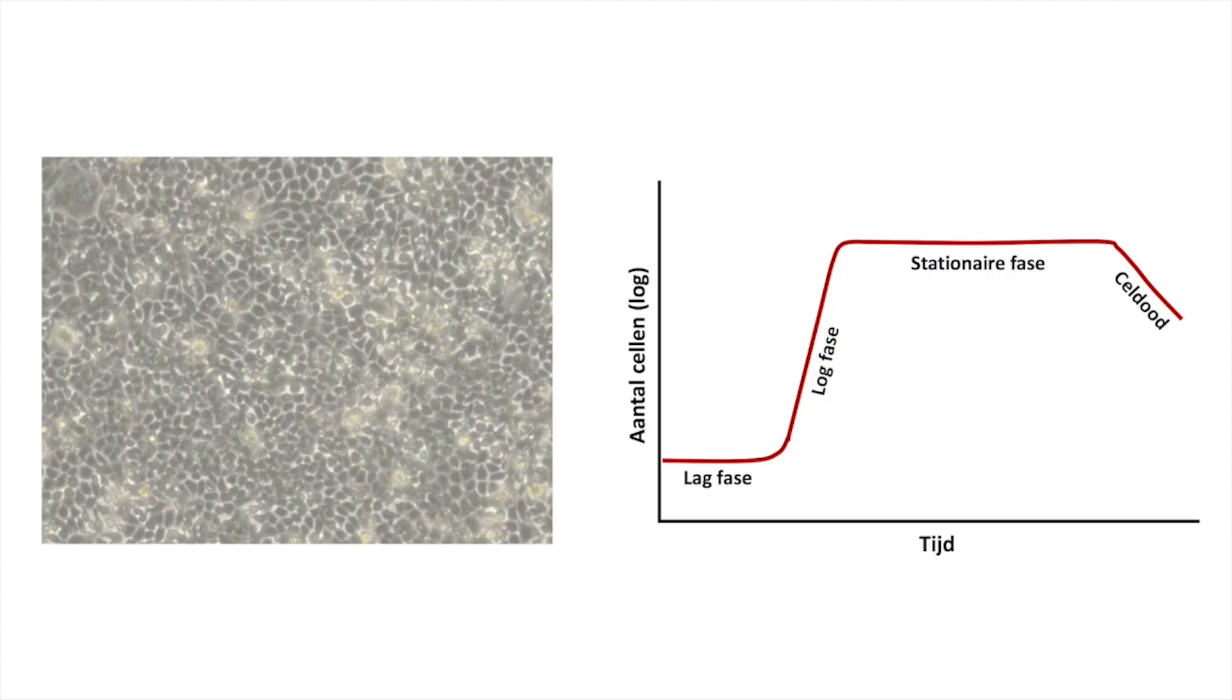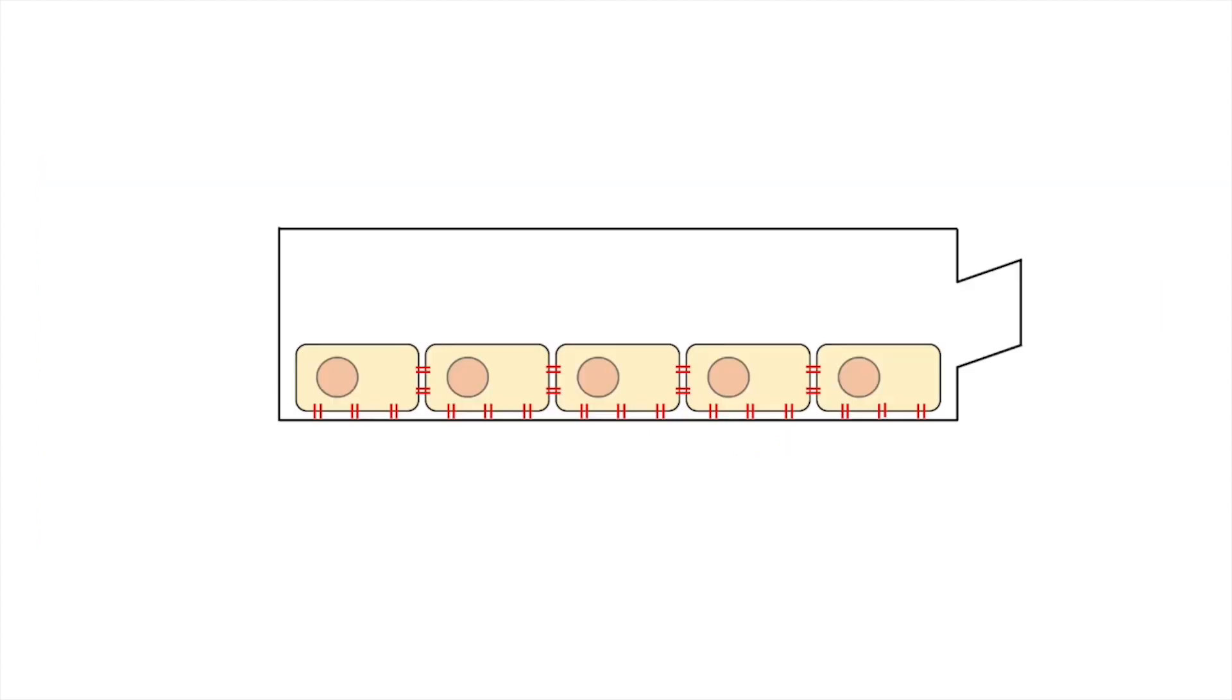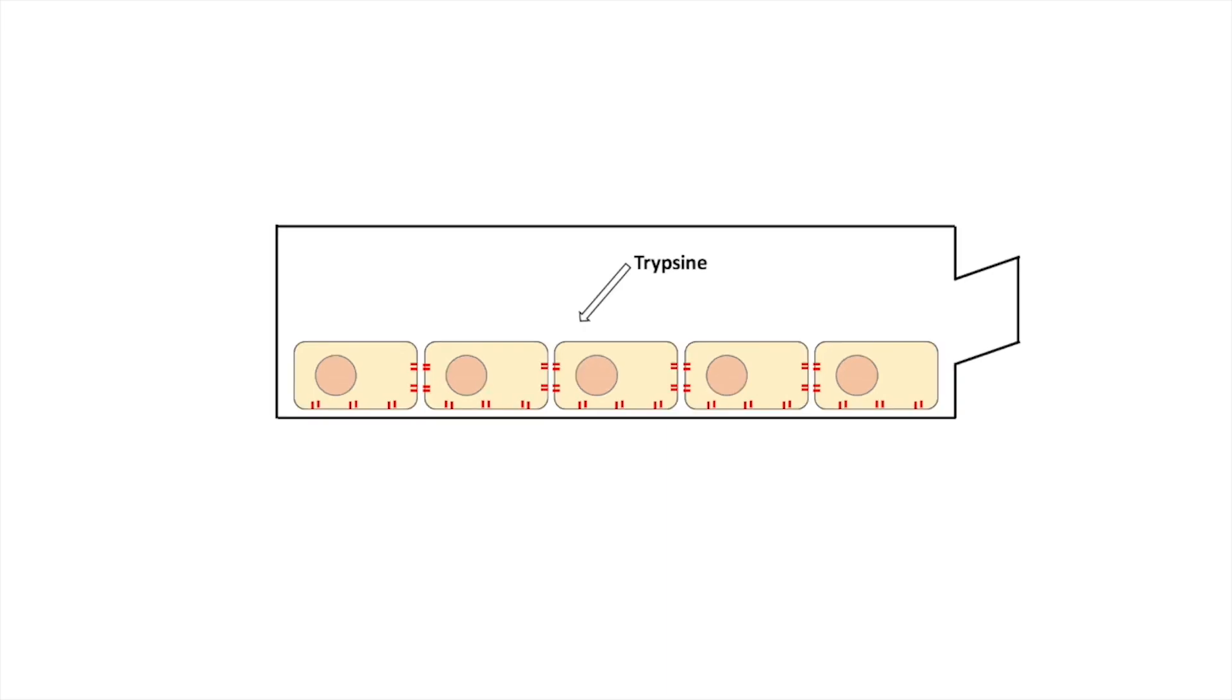Because the culture flask is confluent, the cells must be transferred to a new flask, also known as passaging the cell line. Because you are working with adhesive cells, the proteins that allow cells to adhere must be cleaved using the enzyme trypsin. The medium contains FCS, which reduces trypsin activity. Therefore, the cells first need to be washed with PBS to remove the culture medium containing FCS.